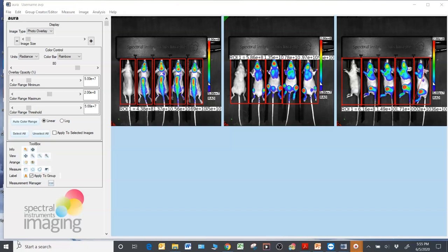And in today's brief tutorial, I'd like to introduce you to a new feature available on Aura, our software platform. This feature specifically is the ability to save the analytical work that you do on your AMI files. Say, for instance, ROI analysis work.